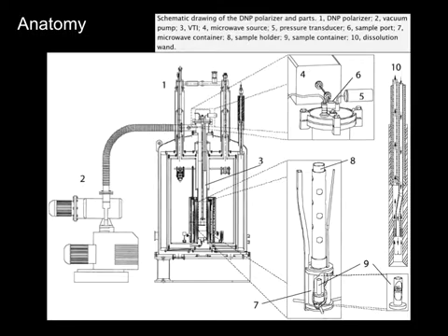This VTI is also filling up with liquid helium, which comes from the same reservoir that is, I believe, keeping the superconducting windings of the magnet, which I think are in here, cold.